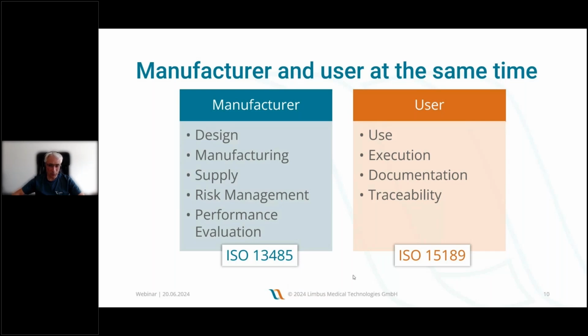So this is where I would like to ask you the first question. Since there are guidelines now, also from official bodies, who recommend that laboratories introduce a quality management system according to 13485, I would like to know, has any one of you working in a health institution already introduced a quality management system according to 13485?